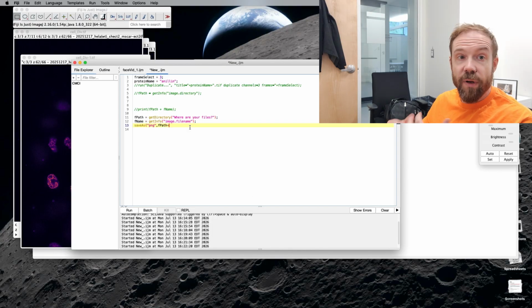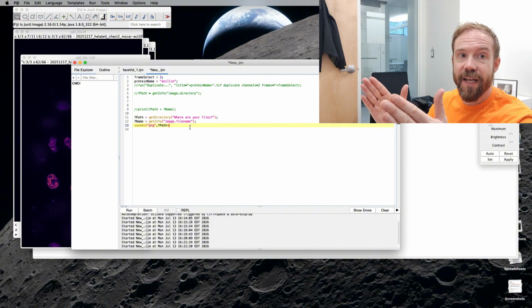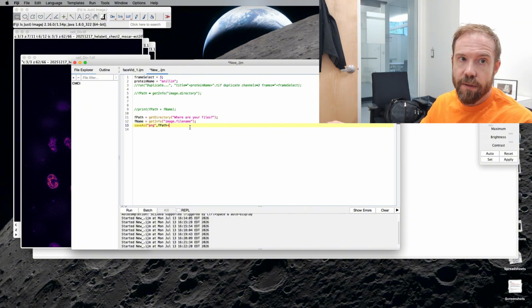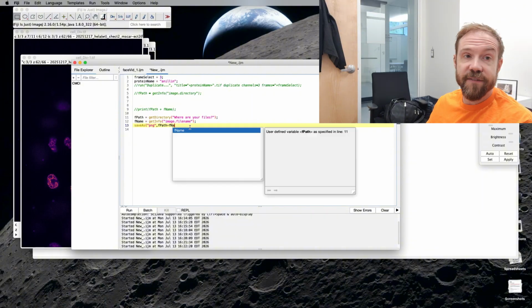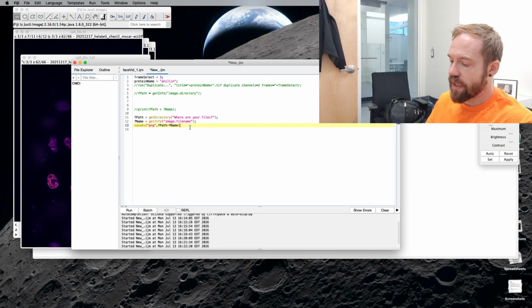Plus, when a file is saved to a location, you have to specify the directory in which it's going to be saved and also the name of the file. You can't just specify the directory. You have to save with the name of the file as well. So we're going to save fname. Now, fname currently ends with .tiff. So we're going to change that to fname plus .png.